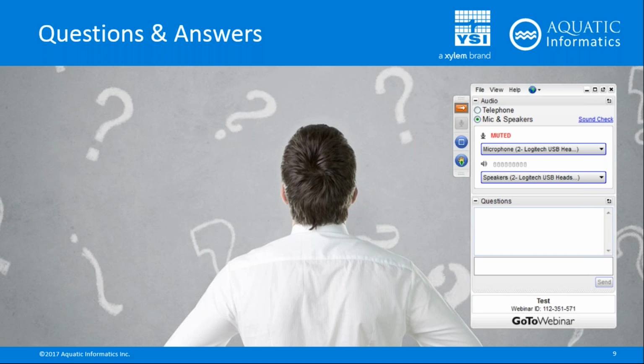Thanks for that, Stephanie. And then another question for you along those similar lines was from Brian. If a single cell forms one CFU, how come one CFU doesn't necessarily equal 1 cell per mil? Yeah, that's a great question that every student of microbiology should ask. It boils down to error and what you're actually looking at under the scope.